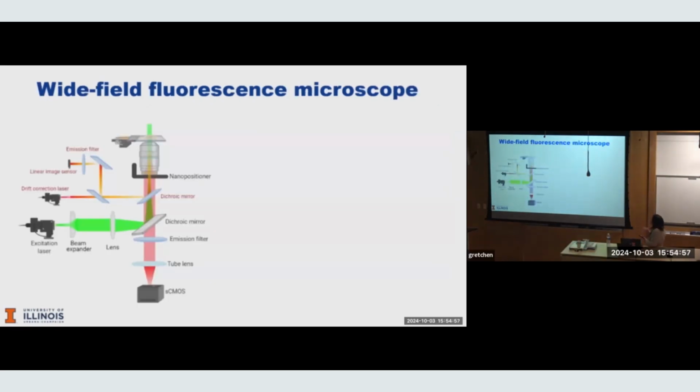There are different forms of super resolution microscopes, as you probably know. The reason we chose single molecule based is that, instrumentation wise, it's a very simple system. It's just a wide field microscope plus a drift correction system to maintain the stability of the focal plane throughout the entire data acquisition.